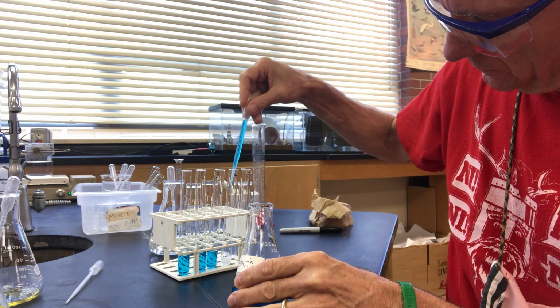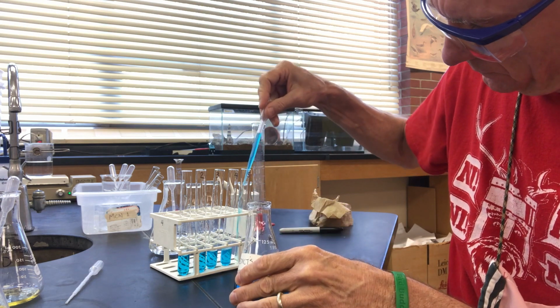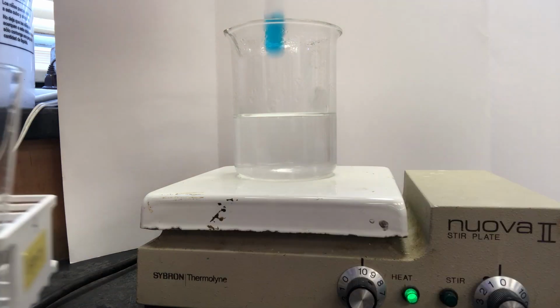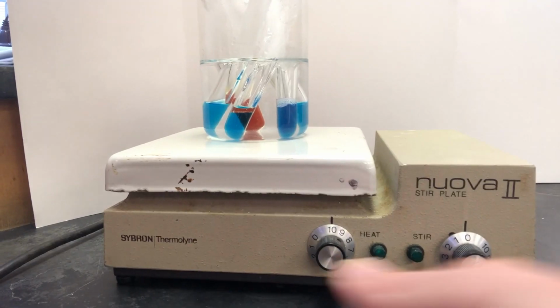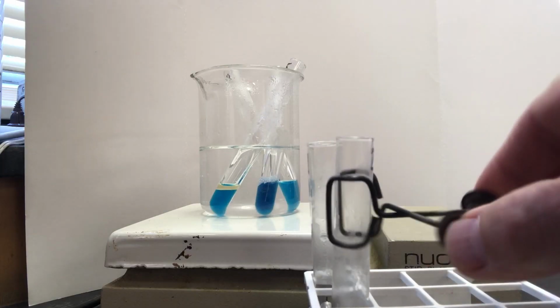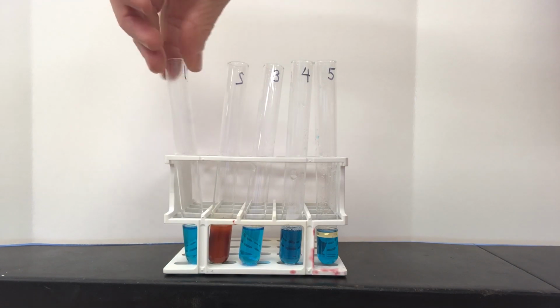To perform the test, add 3 milliliters of Benedict's solution to each sample tube with 1 milliliter of sample. Put on your safety goggles and turn on the hot plate, and bring the beaker of water to a boil. Add all of the test tubes with their sample reagent mixture to the boiling water. Allow them to boil for 3 minutes. After 3 minutes, turn off the hot plate and use the test tube tongs to remove the test tubes to the test tube rack. Observe the results for each tube.